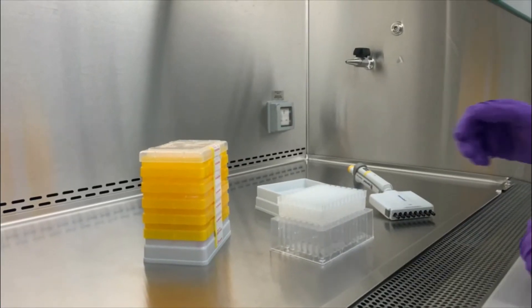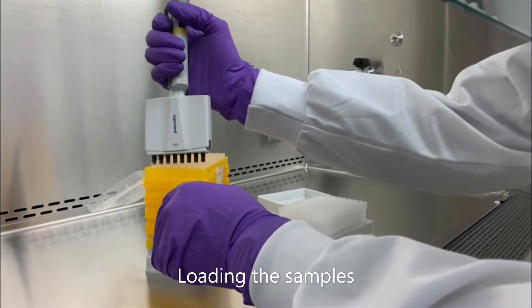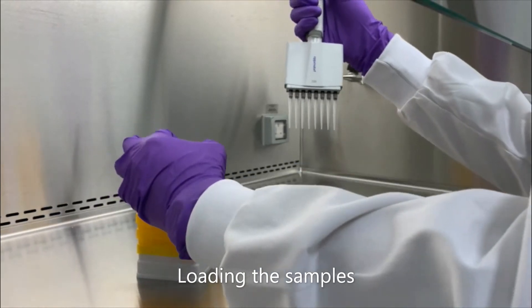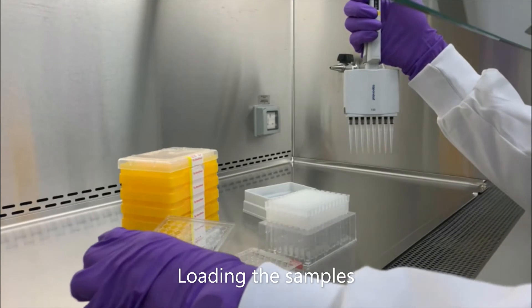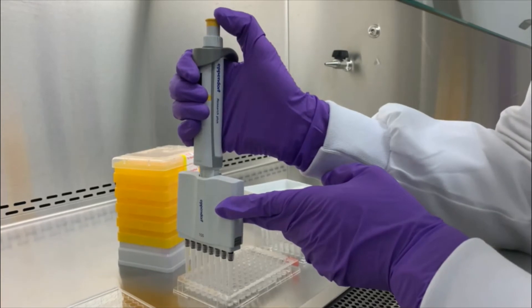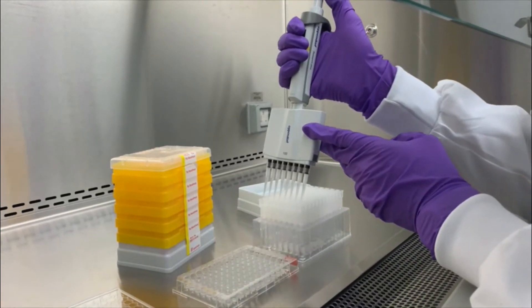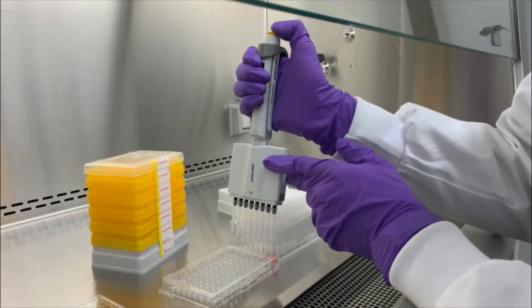Now it's time to add your samples. Transfer 100 microlitres of each sample to each column and allow the sample to enter the resin bed. As the samples travel through the resin, free proteins and small molecules are retained in nano-sized pores within the resin. The larger exosomes pass through more quickly and will elute first.